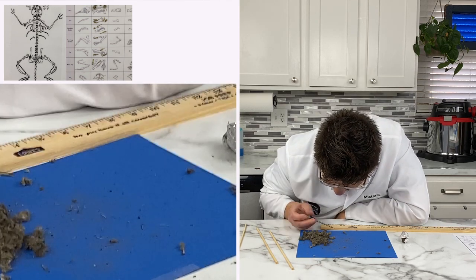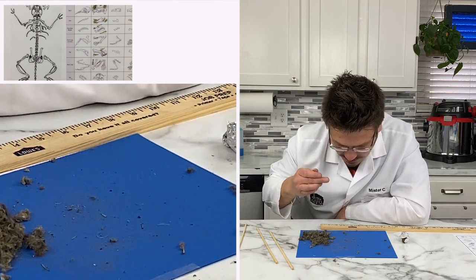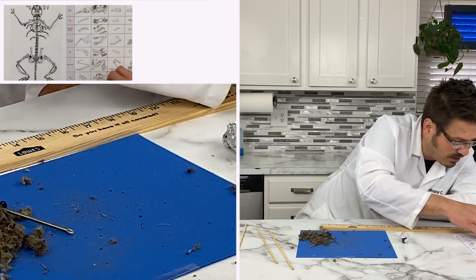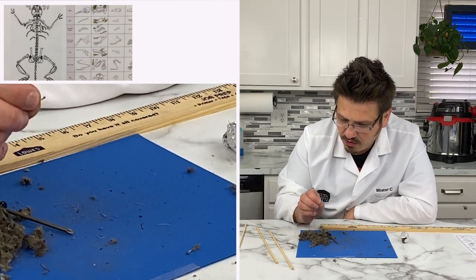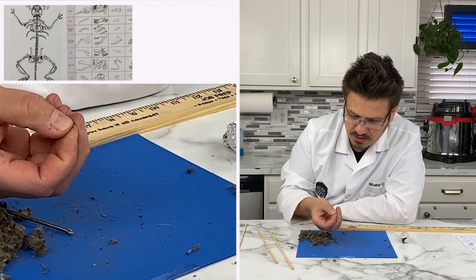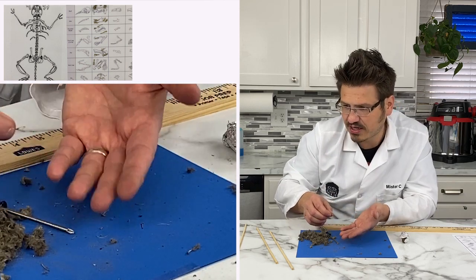Pull up my glasses for a second, get down low. Is that a vertebrae? Could be. It's super hard. Oh, nope. I think I found a vertebrae. So I think I found a little vertebrae. But yeah, we have all of these parts. Back leg. We have, it looks like, this is definitely a hip bone. Gosh, it's so small.